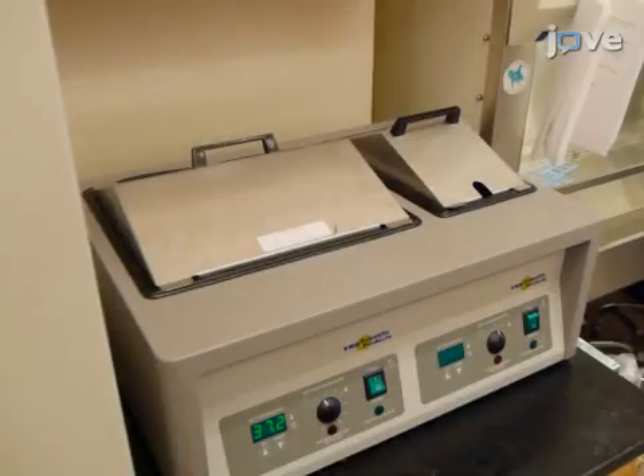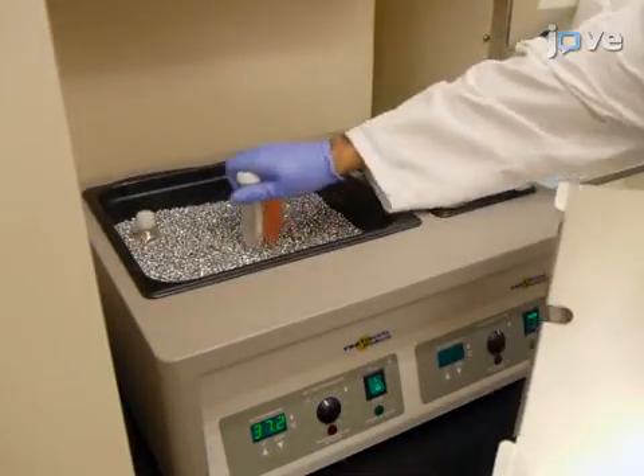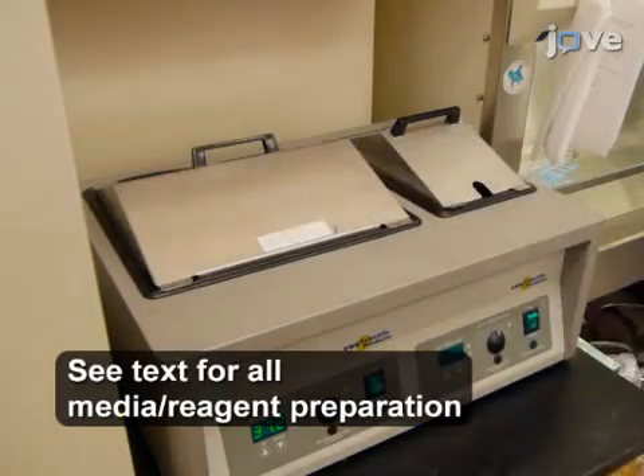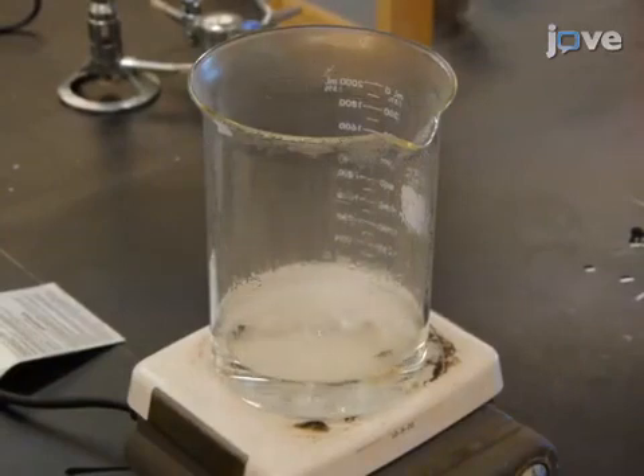About an hour before the injection, pre-warm a non-trypsin cell dissociation solution, sterile PBS, and culture media to 37 degrees Celsius. Disassemble and place the components of a syringe with a 33-gauge blunt needle in boiling water.